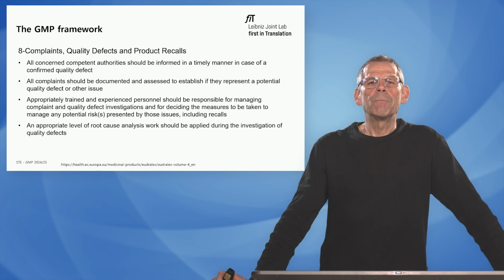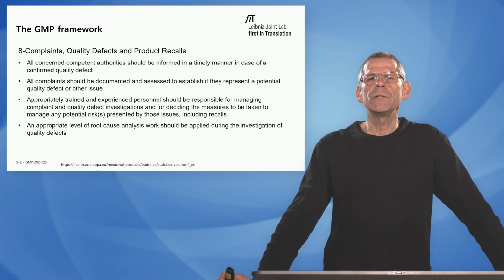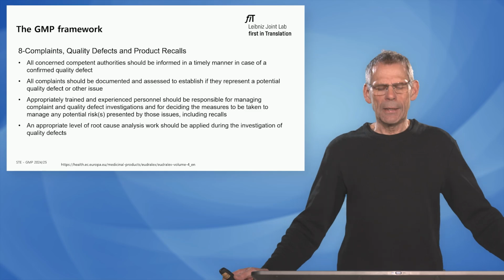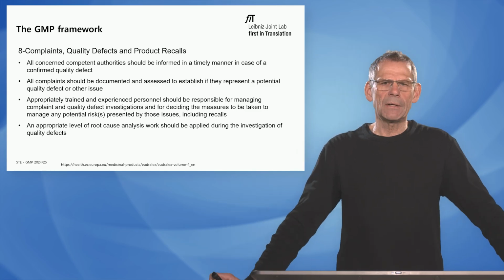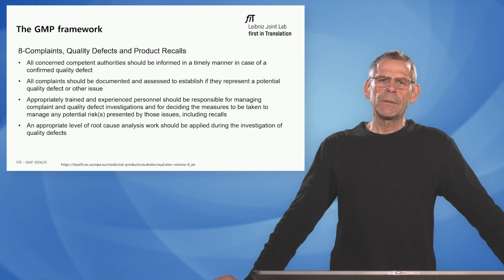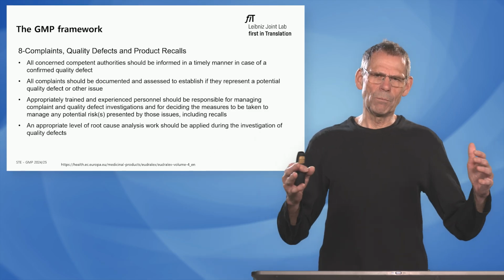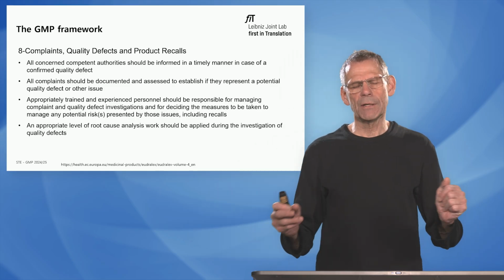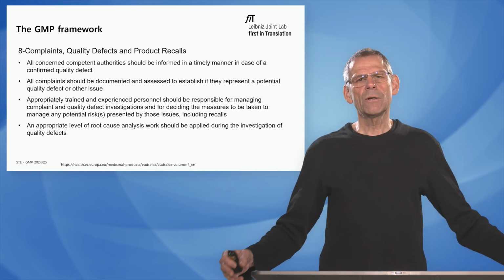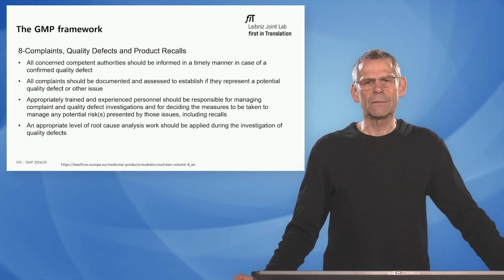And an appropriate level of root cause analysis needs to be done. We need to investigate why this quality defect occurs, because this gives us the possibility to modify our quality system or our manufacturing process to avoid that this quality defect occurs another time.